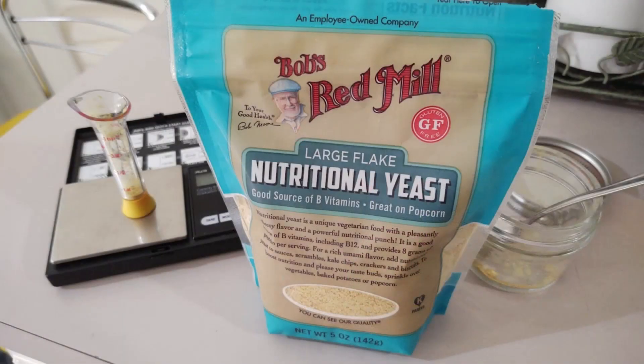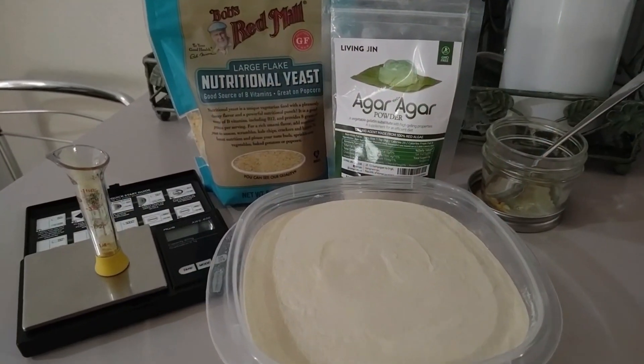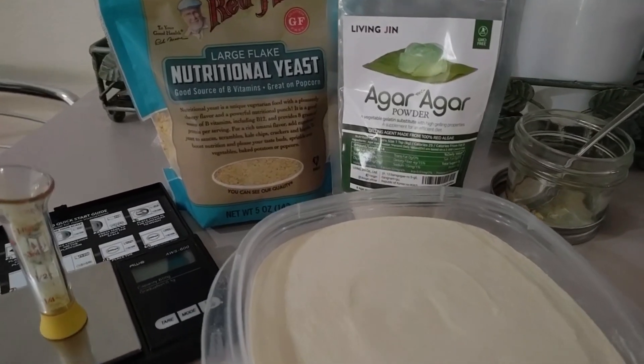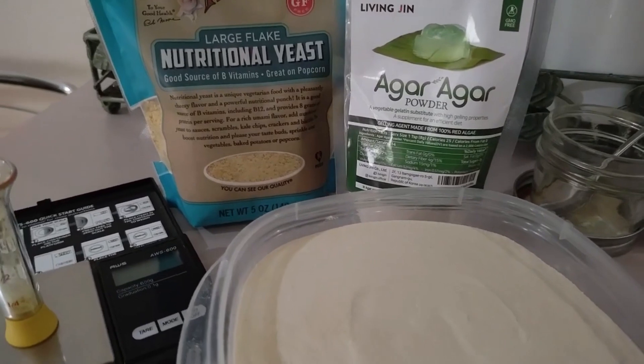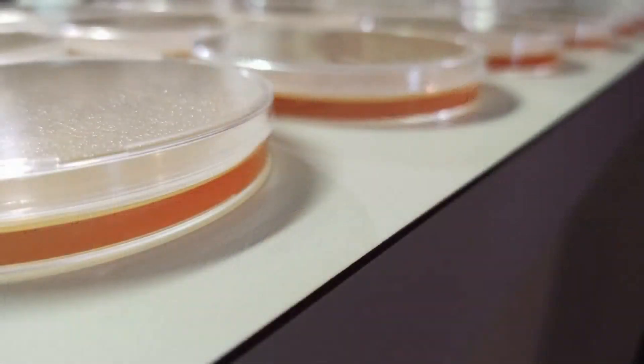Through much research and many transfers, we found the perfect recipe to get that beautiful rhizomorphic growth we wanted. MYA, or malt yeast agar, is an amazing agar recipe. This recipe gives the perfect nutritional source from the malt extract, but the addition of nutritional yeast will promote that booming rhizomorphic growth in your mycelium cultures.